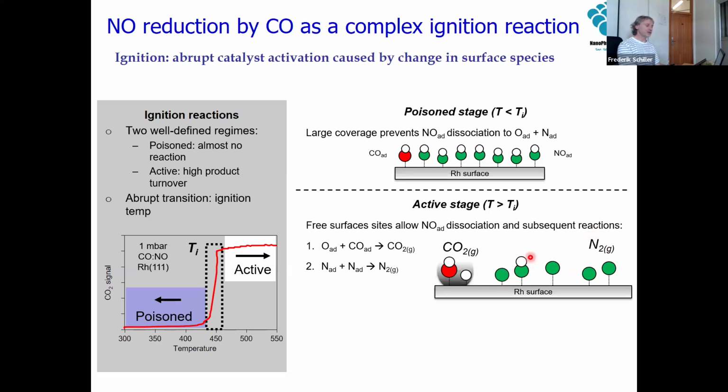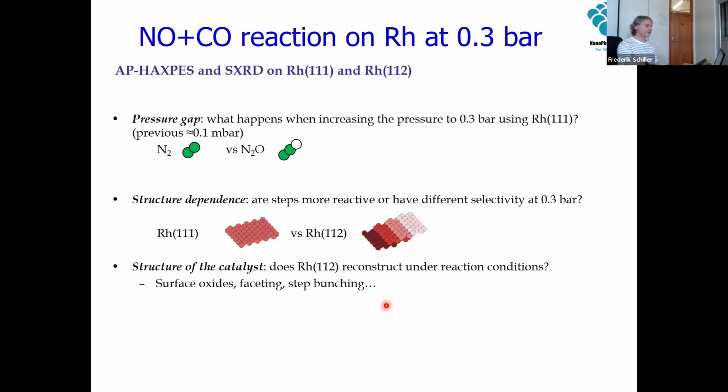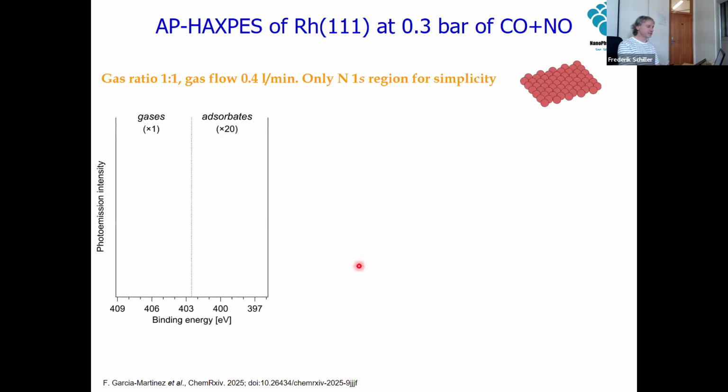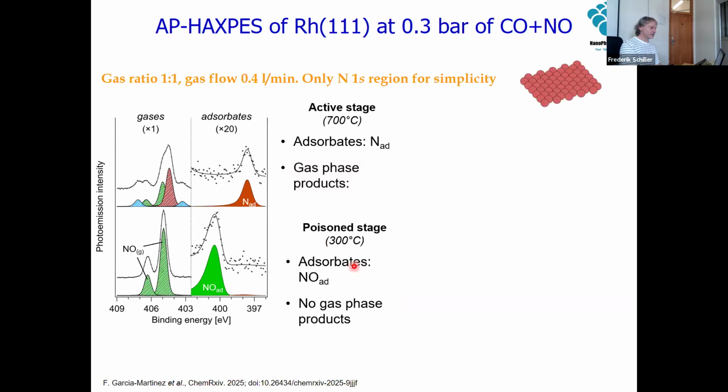Or what you see also here, we combine them with another NO. And this is the reaction that we do not really like, because we would produce N2O, which is also a poisonous gas. So here we can actually study selectivity. I will go quickly over. Basically, we will do just one comparison, rhodium 111 and rhodium 112, because curved crystals do not work in this setup.